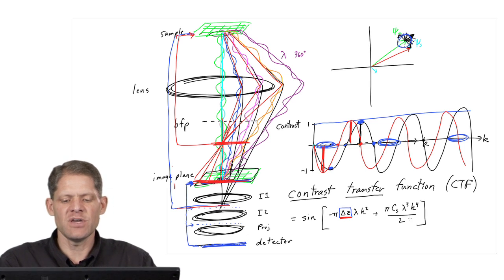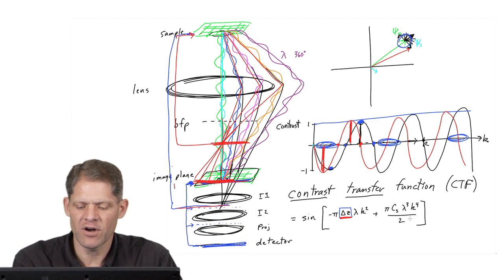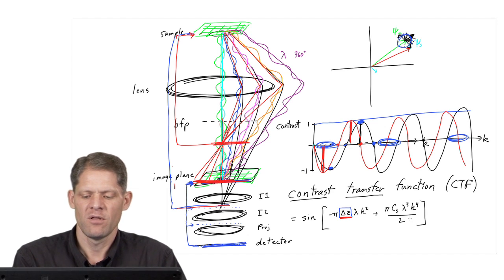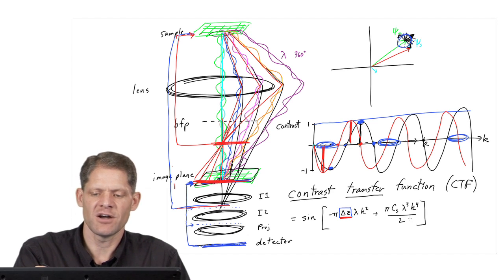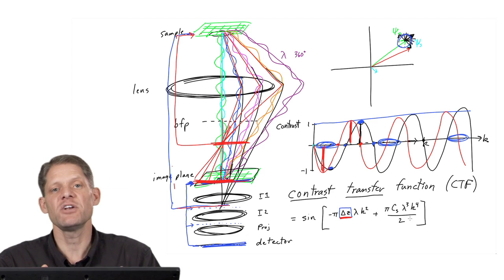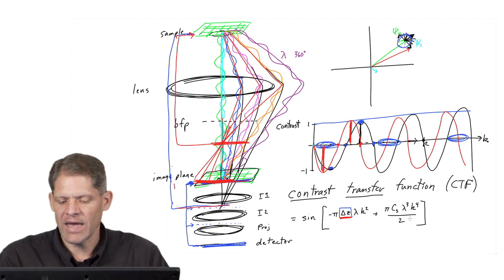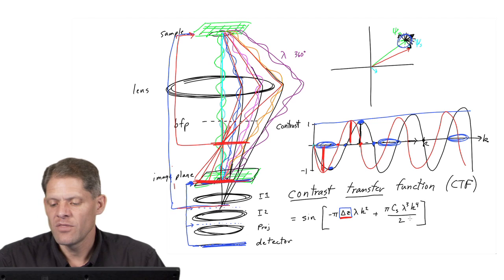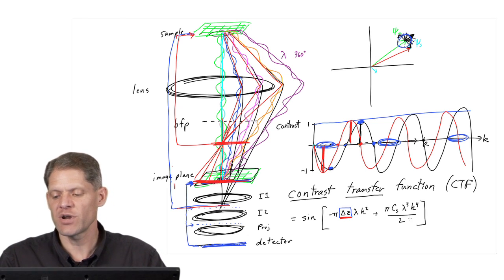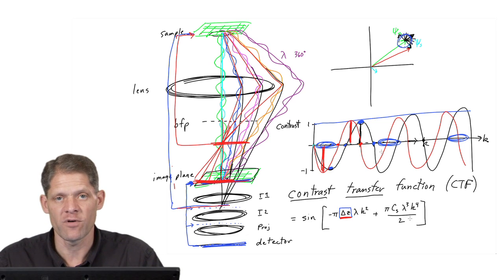And in that case, you get what's called an over-focused image. You're recording a wave function below the plane that's conjugate to the sample because your objective lens has too much current, it's too strong, and that's over-focus. And in an over-focused image, the contrast transfer function again is shifted due to that over-focus.